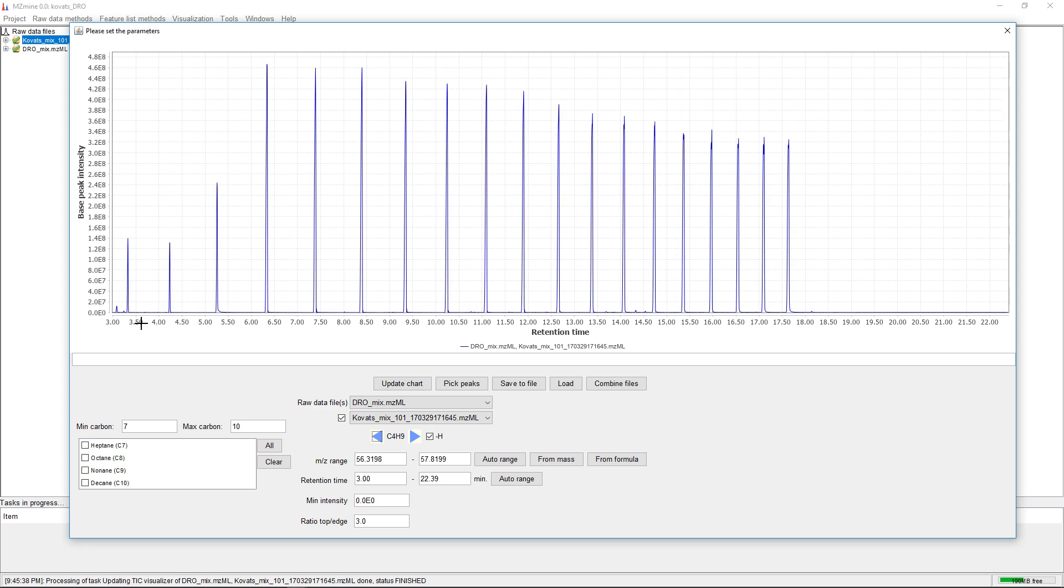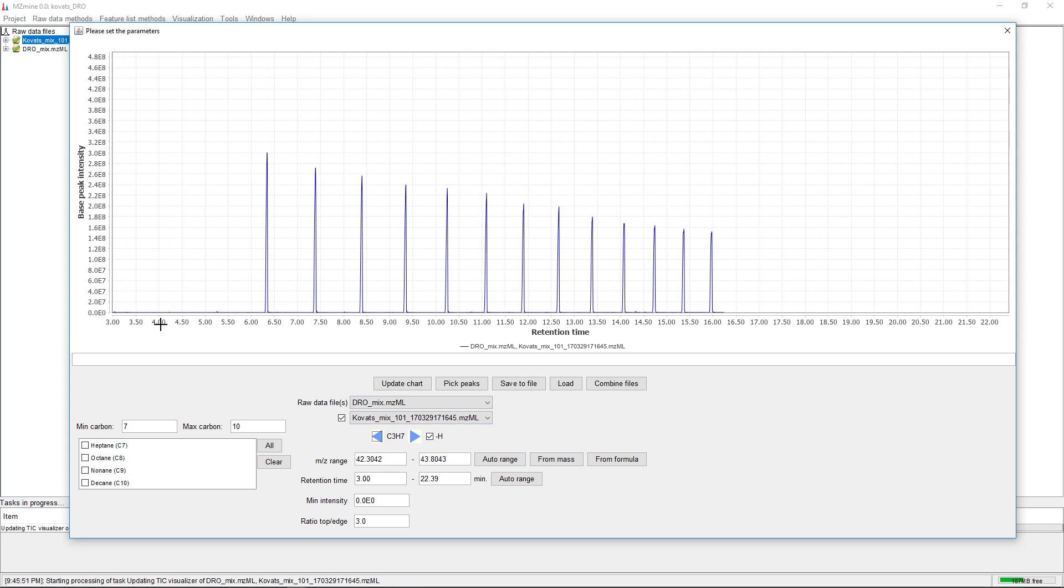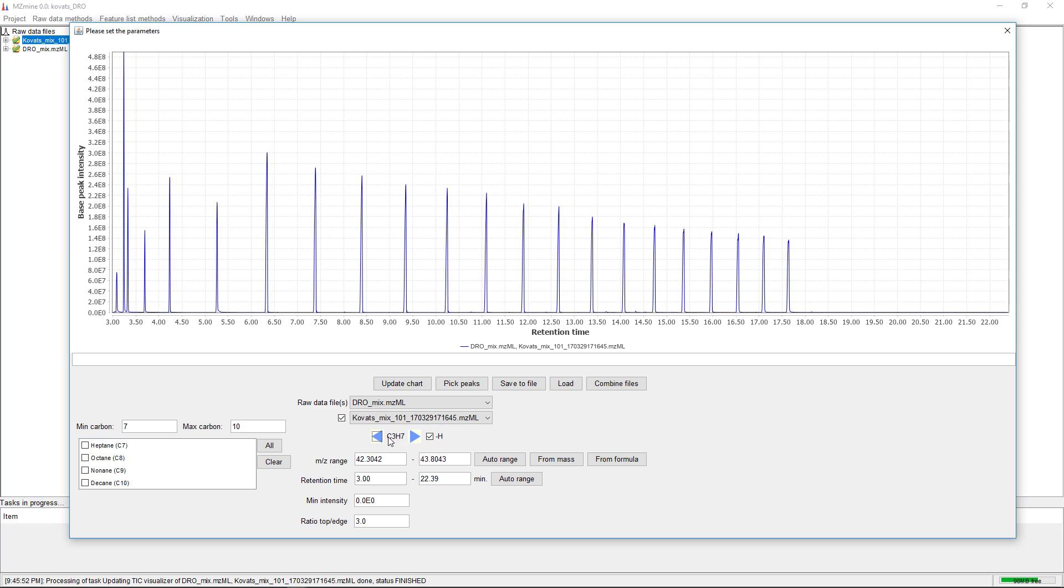Here we can see we have minor peaks that don't belong to the standards. If we go lower, we can see there are different compounds in the mix, like benzene.